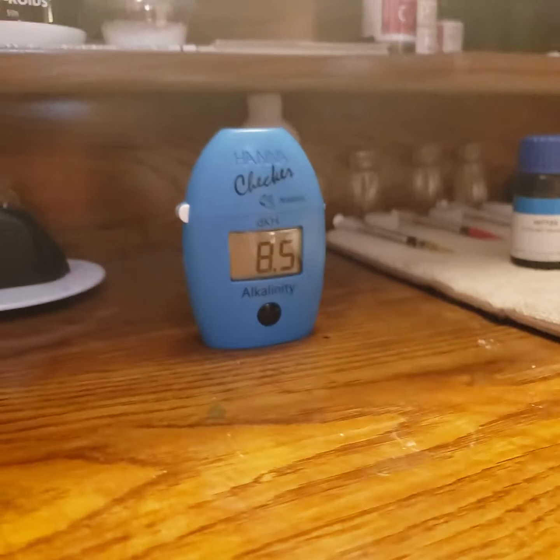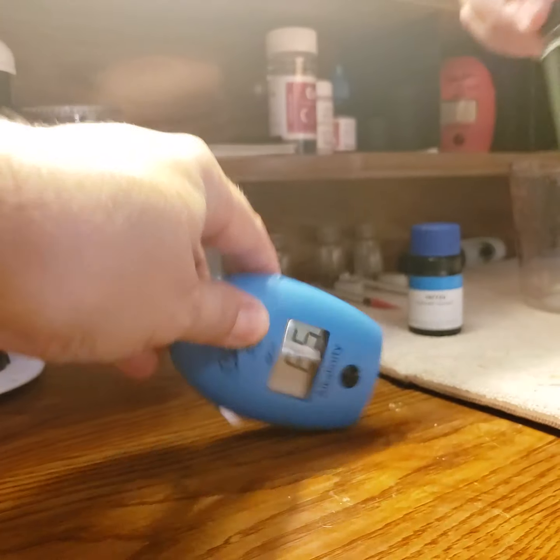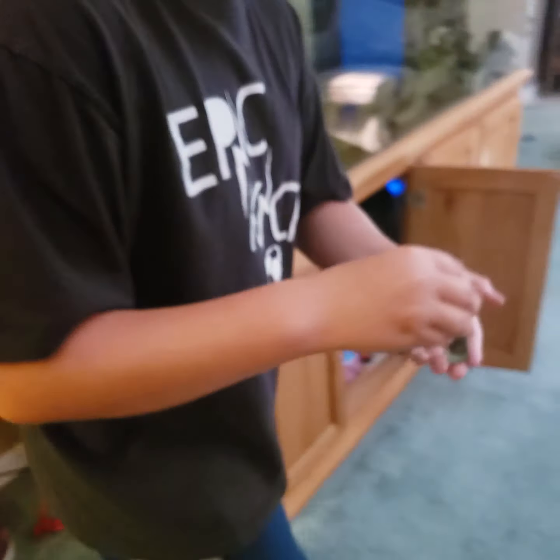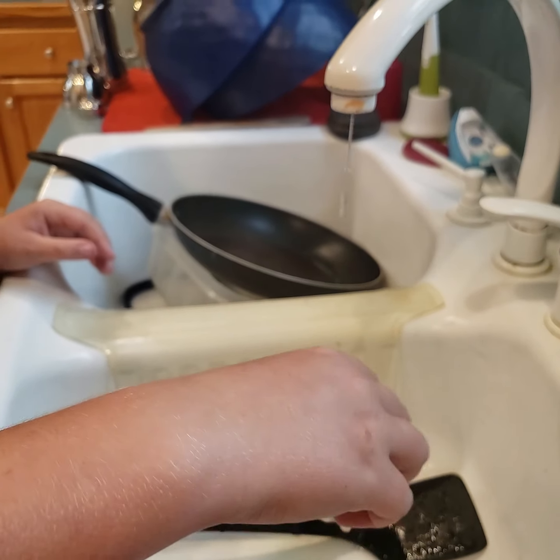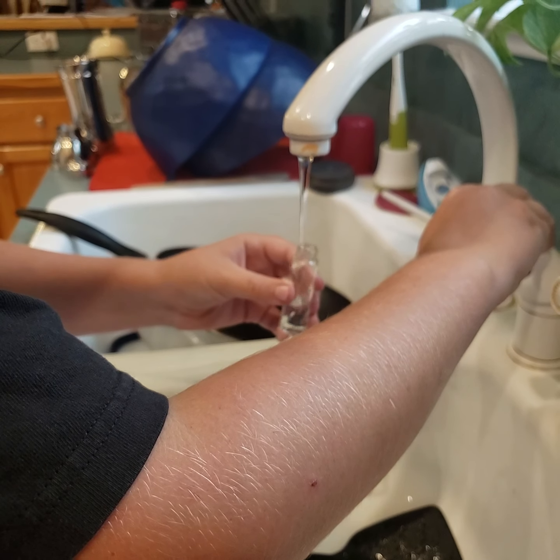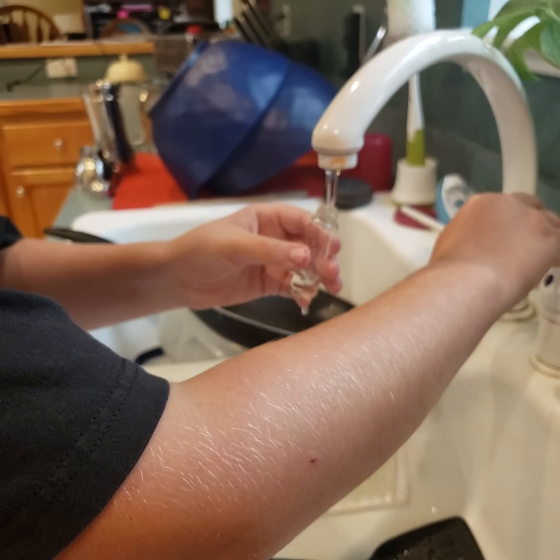Okay, Mom, so now we're going to remove the vial from the container and we're gonna rinse it out. So you close this up. Oh, sorry. Turn it off. Take the vial over to the sink, rinse it with regular water. So here Griffin's going to dump it. He's gonna use regular water to rinse it. Rinse and dump a couple times, and don't forget to do the lid also.